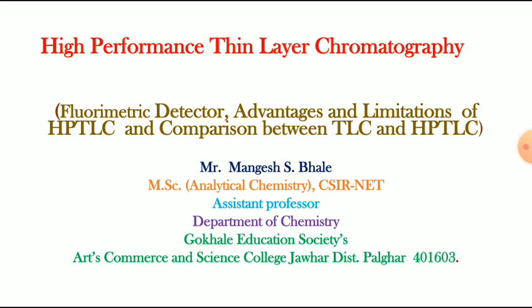So, in the previous lecture, we have seen the double beam densitometer and fluorometric detector. That means the last step from the HPTLC operation, that is detection and visualization, we have completed in the previous lecture. So in today's lecture we are going to learn the advantages of HPTLC and its limitations, and finally the comparison between the ordinary TLC and HPTLC. This part we are going to learn in today's lecture.